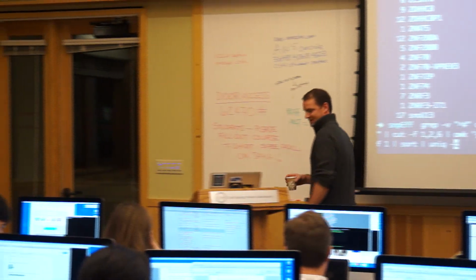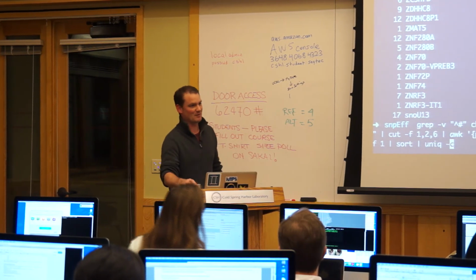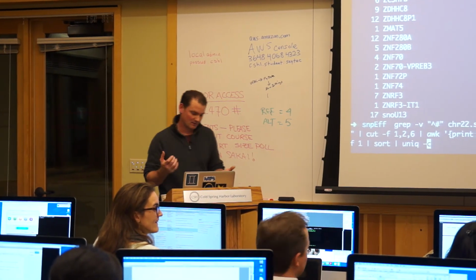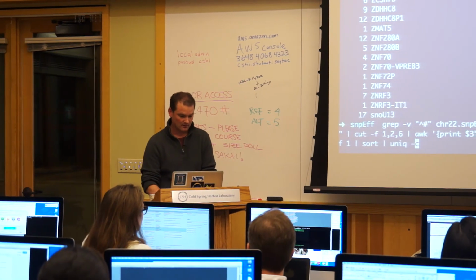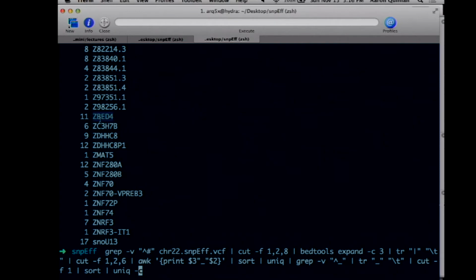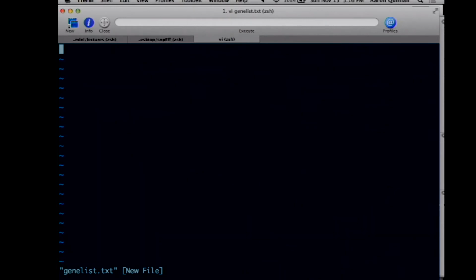do you happen to know a gene off the top of your head that's on chromosome 22? Probably not, but if you do. I checked a couple things to see if there's anything. Because one simple thing you could do, let's just do a control. If you had a list, let's create a gene list. And I'm just going to put this one gene in there.